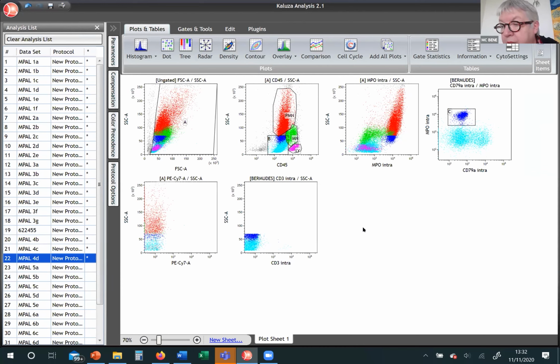He evolved into an M4 myeloid leukemia with no sign of the B cells remaining. Then he was treated with an AML protocol, and he received an allogenic transplantation. And he relapsed, and at relapse, we saw exactly the same pattern as at diagnosis, with, again, this population of CD79A with some MPO on it. So that was a very bizarre case.